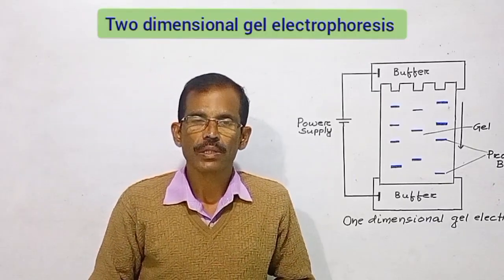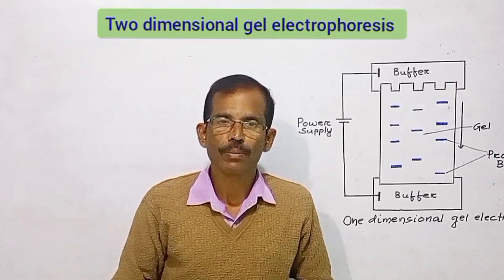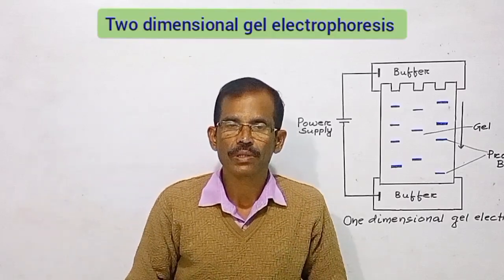Today we shall discuss two-dimensional gel electrophoresis.